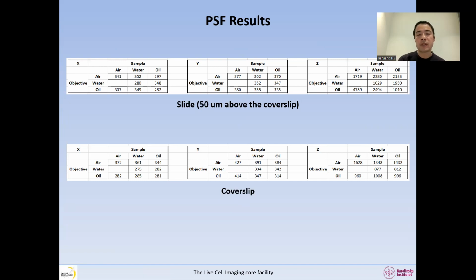Later on, we will do a small exercise based on this measurement. You will try to explore this table with some questions and compare the results of the point spread function with matched and mismatched data.